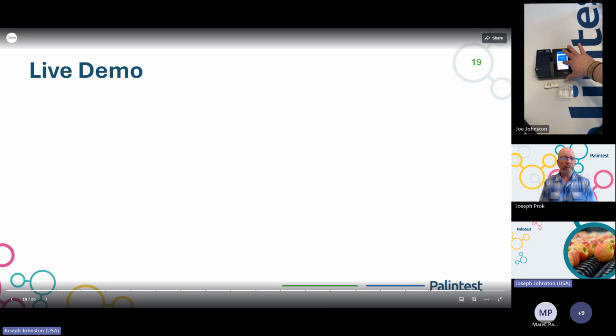This here is a touch screen, so all you simply need to do is hit perform test. A little IR beam is going to shoot out, and see right here. You can see that the Chemio instantly knew what it was testing because it scanned that barcode. So that barcode's telling you what it's testing.